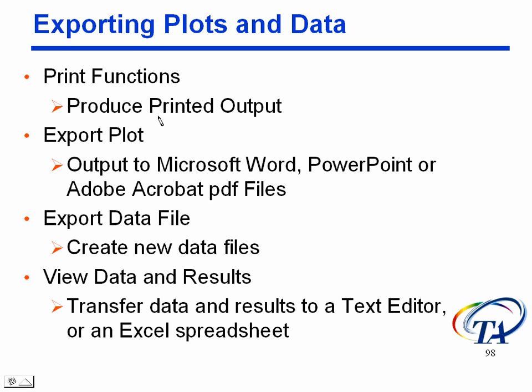Okay. You can also export new data files. Okay, so this is how you create new data files. So when I was talking to you earlier about using tools and smoothing and shifting and applying baseline files and things like that, if you want to save that stuff, you have to create a new data file. This is how you do it with the export data file function.